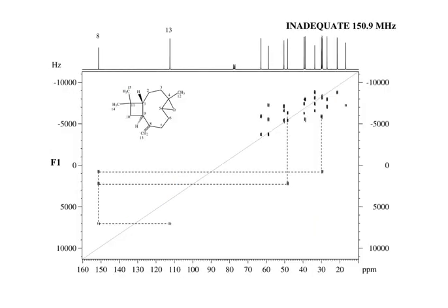Okay, so this is another terpene. It's called caryophyllene oxide, and obviously it's a lot more complicated. This one, I think, had a problem with it, though. Something was wrong.